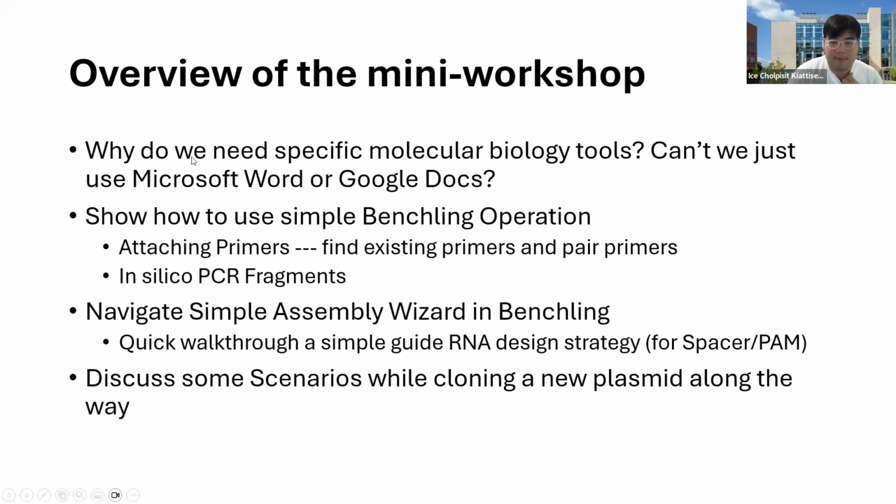So the outline is that I will present a little bit of an intro on why we need these specific molecular biology tools. On the Benchling side, we will show how to attach primers, how to do PCR, and then navigate some simple assembly work in Benchling. I plan to cover restriction digest, Gibson or In-Fusion assembly that we have been using so far, and also Golden Gate.